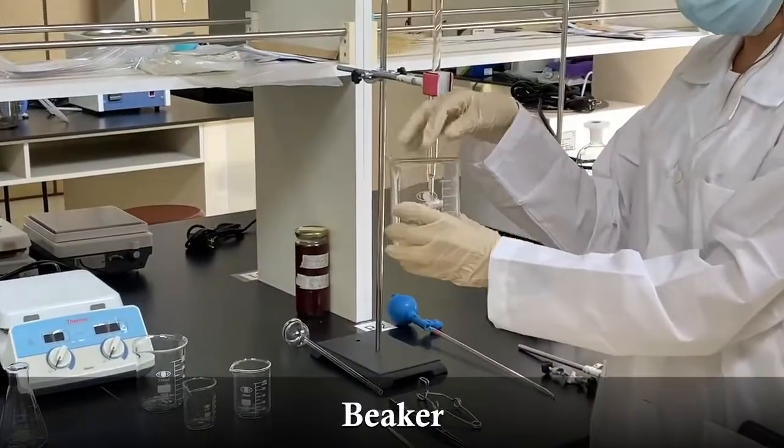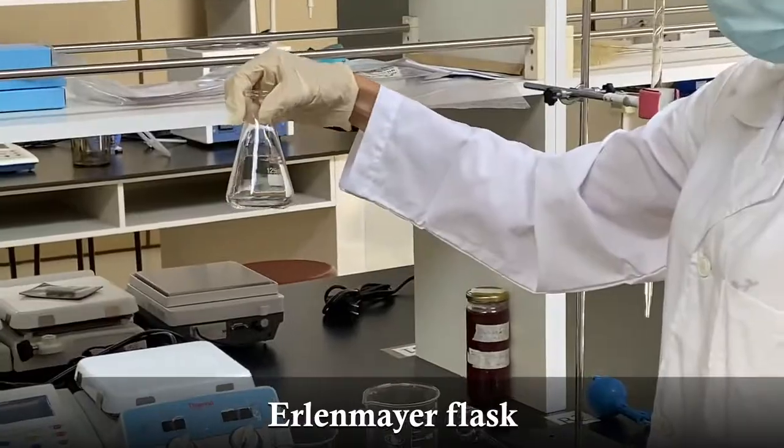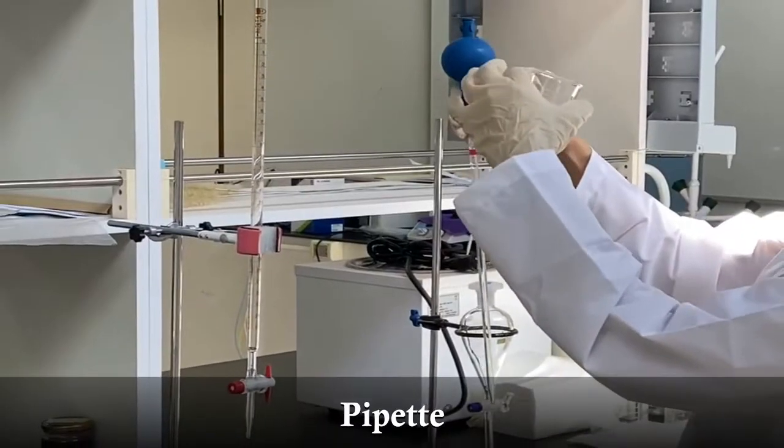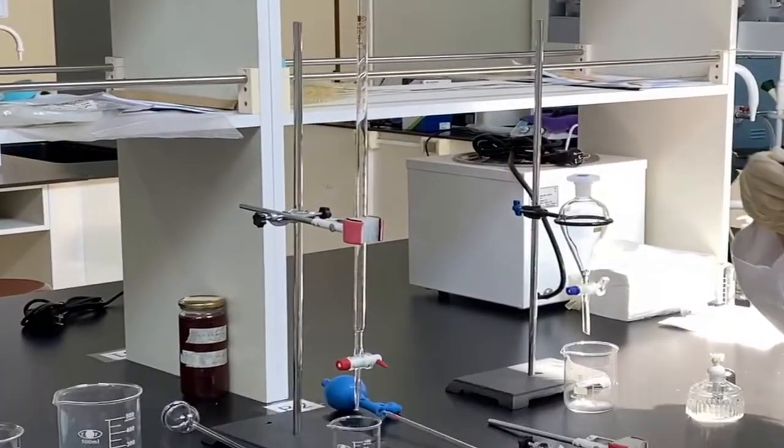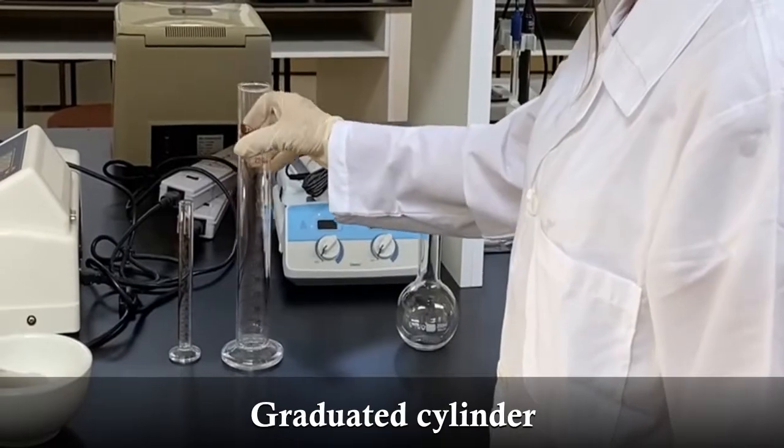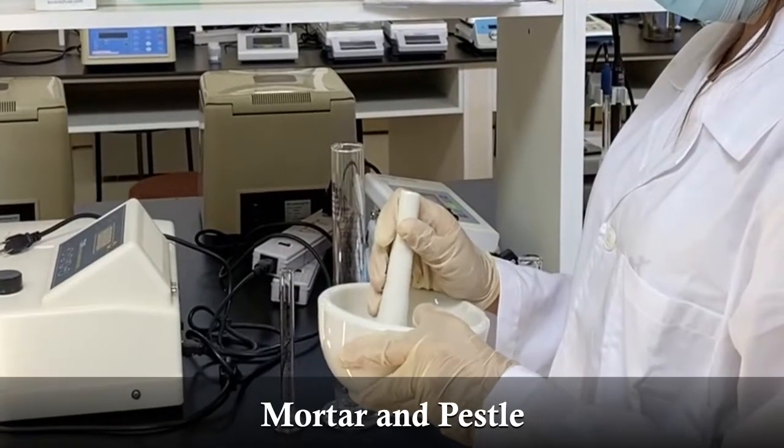We can mention the beaker, test tubes, Erlenmeyer flask, Florence flask, funnel, pipette, burette, volumetric flask, graduated cylinder, crucible, mortar and pestle, and others.